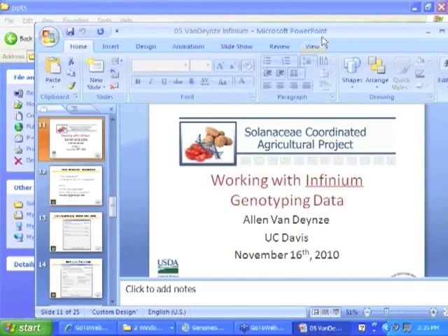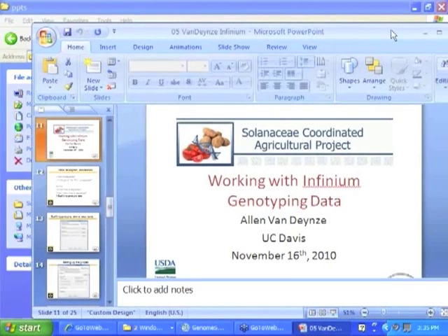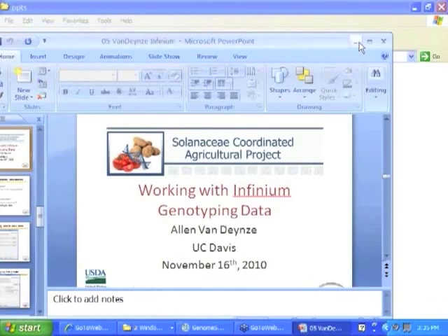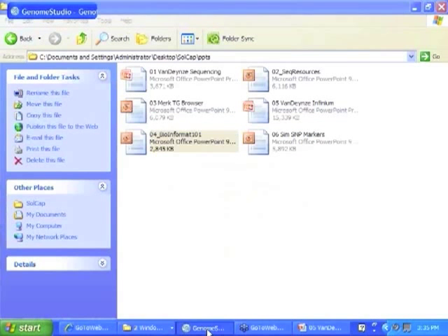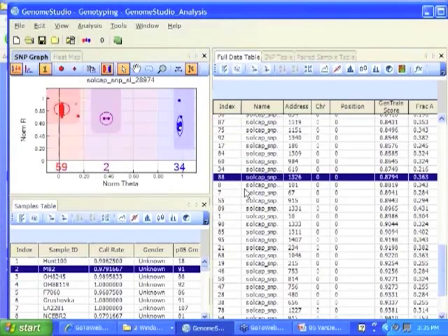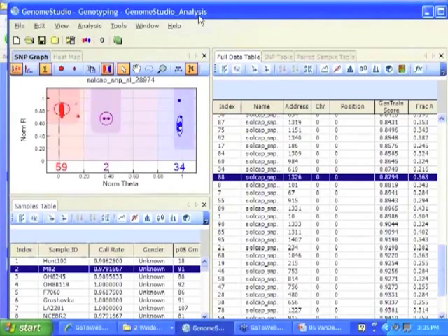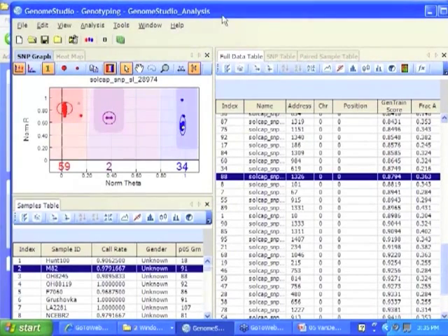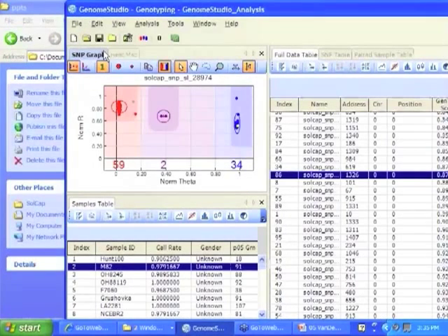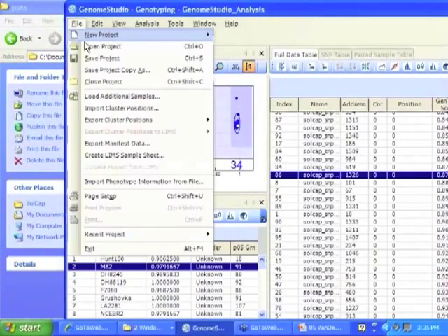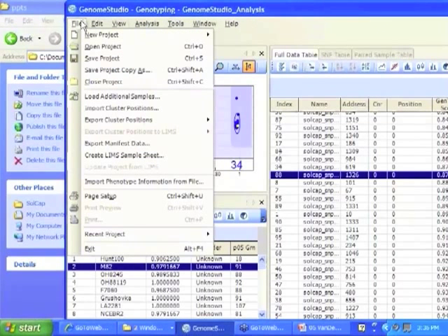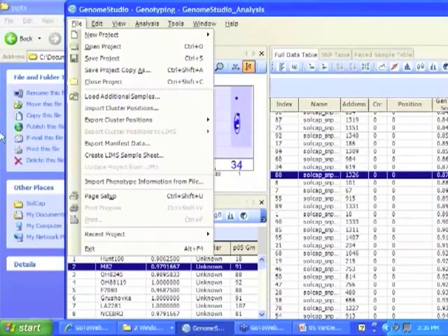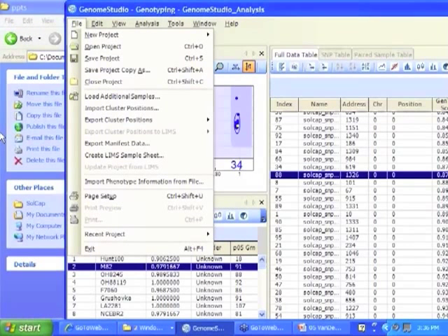So I'm just going to shut this down for now and go to Genome Studio. So this is Genome Studio and if you go to your first page, first of all, the software is downloadable from Illumina, but they will charge you for it for a little number that allows you to open it.